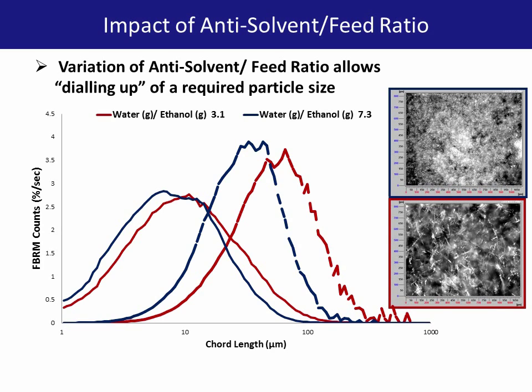When the relative anti-solvent flow rate increases, both the square-weighted and unweighted chord length distributions shift to the left, indicating a decrease in mean crystal size. This trend is confirmed by the PVM images, which show a shift from a distribution of some fines with larger, more needle-like particles to a distribution nearly exclusively of fines below 10 microns in length as the anti-solvent ratio is increased.